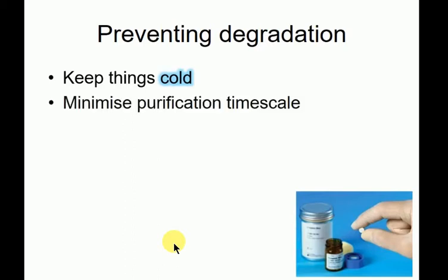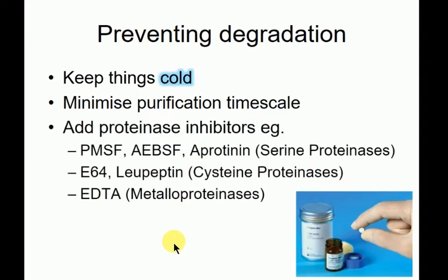Minimize the time scale, as I've mentioned. Protease inhibitors, like PMSF, will inhibit serine proteases. You've got cysteine protease inhibitors, EDTA, as long as you're not using a nickel resin. And sometimes you can get these combined in a cocktail tablet.